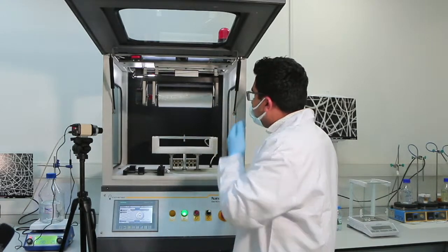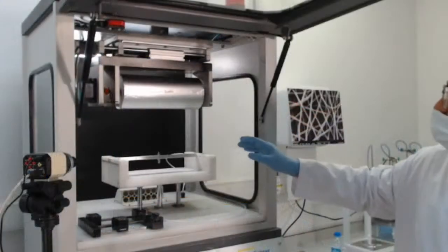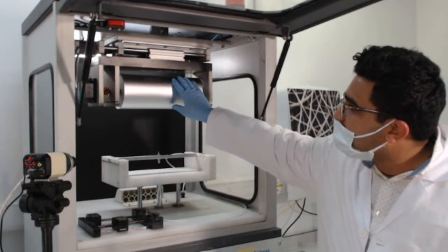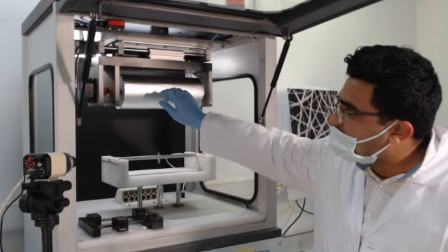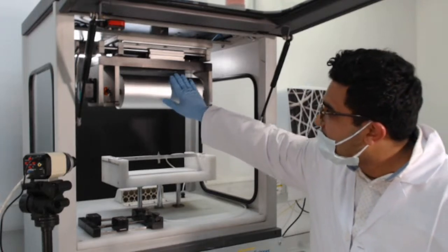Before going further, I'd like to mention, for the purpose of this demonstration, we're going to show you the drum collector. I've already taken the liberty to put in the aluminum foil right here, so that I can scratch it out and show it to you after the process.